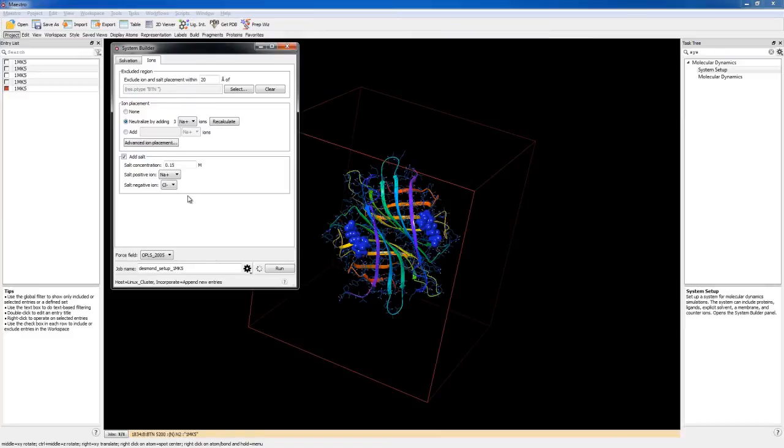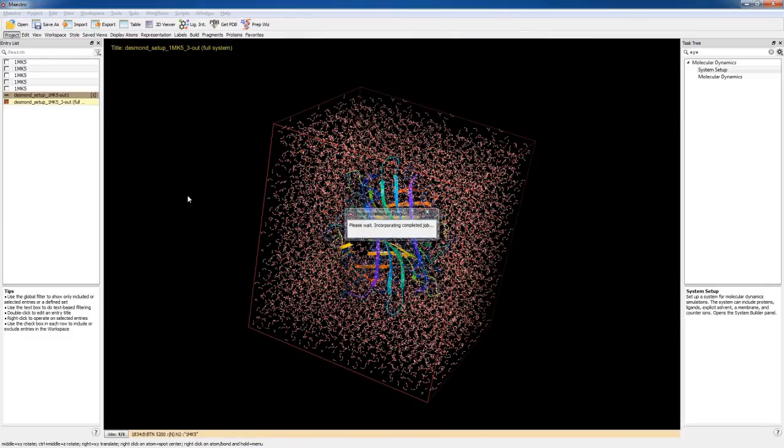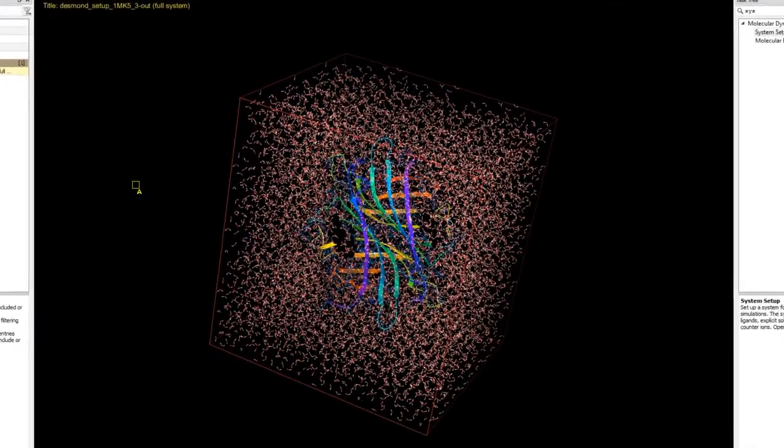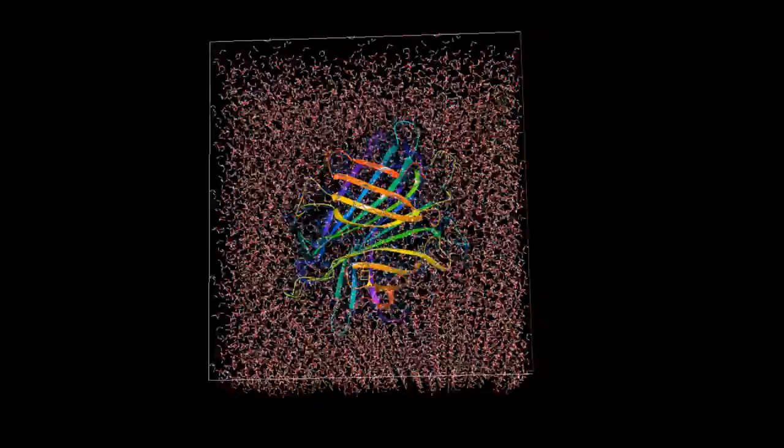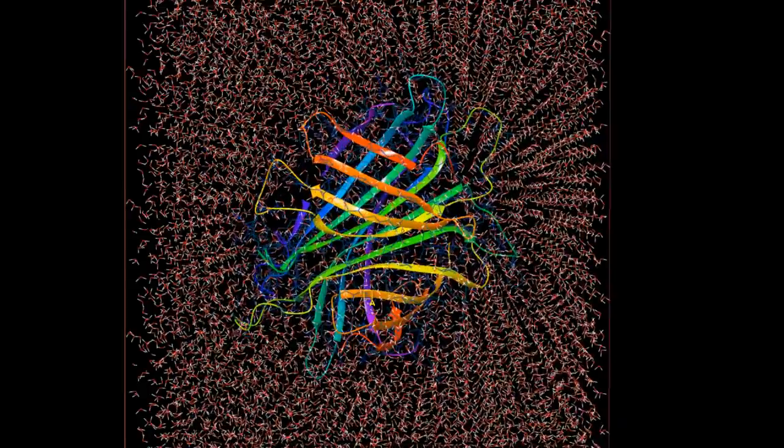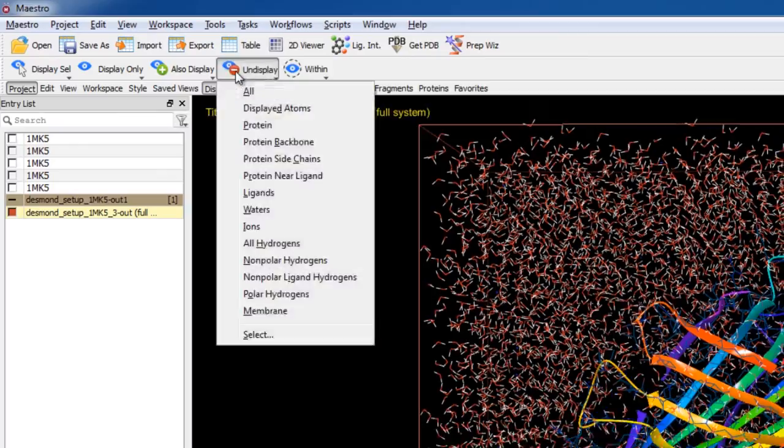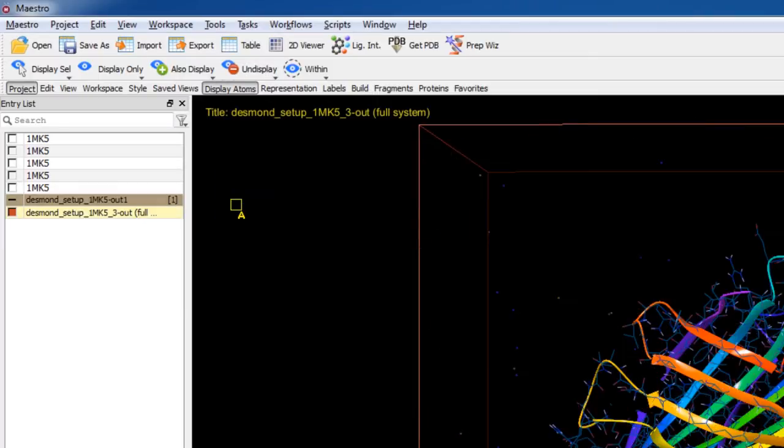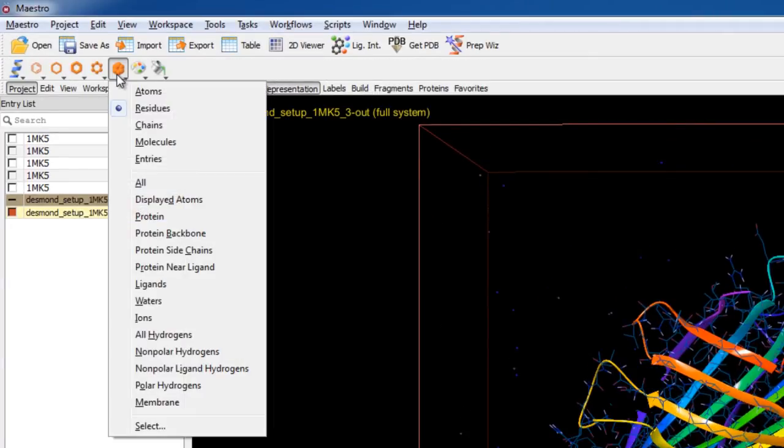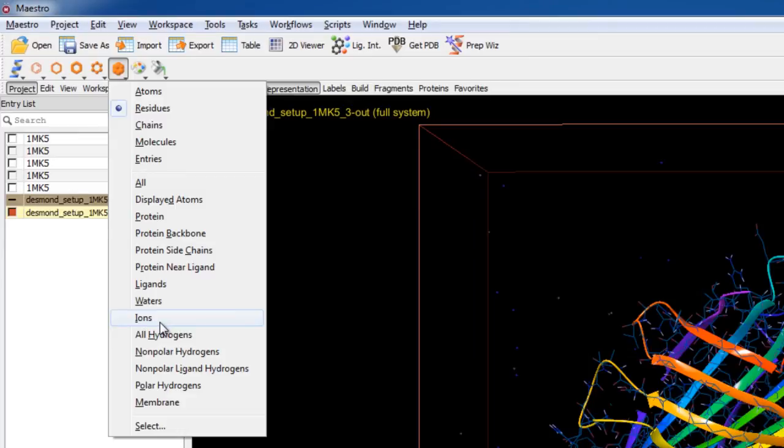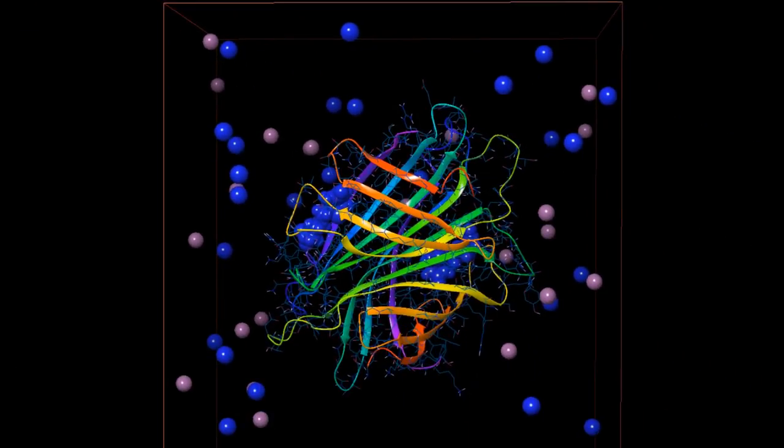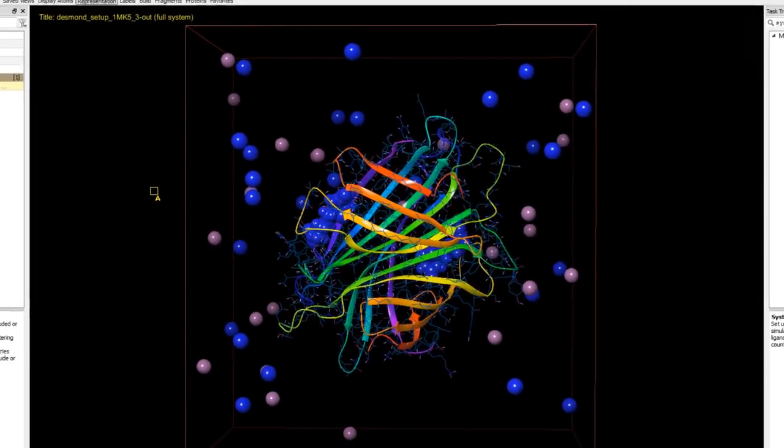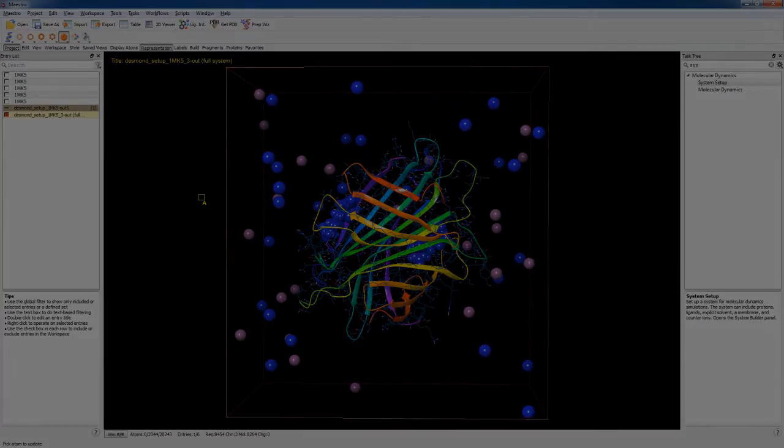Once the job finishes, the system is incorporated into the workspace. Here you can see the protein, solvent, and ions. We can undisplay the waters and show the ions as CPK to see that the ions are now 20 angstroms away from the biotins. The system is now ready for simulation with Desmond.